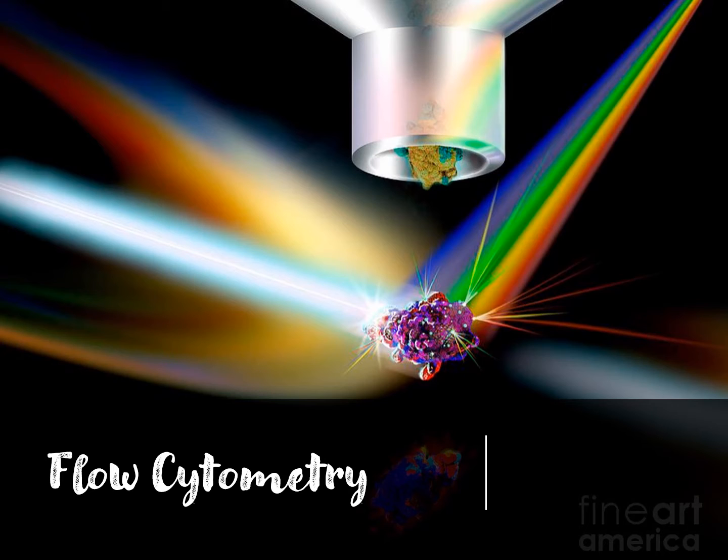I wouldn't say it is very common, but it is pretty commonly utilized in different laboratories for sorting cells or for counting cells in a population to identify perhaps the differential distribution of different cell populations in any specific system. So without any more delay, let us just dive right into the topic of flow cytometry.